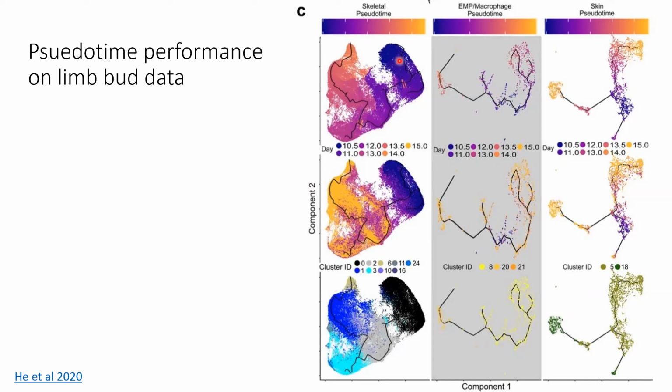And you can see how it kind of forces this gradient over time that doesn't really exist in the real data. It's kind of there, but a lot of the transitions are imposed, and there's different overlapping spaces on parts of the graph that are totally missed. And the same is kind of true for the clustering. It can identify different bulk dense regions, but it kind of misses the regions that are more in between. So this is a pretty complex looking shape that gets totally missed by the cyan cell type cluster here.